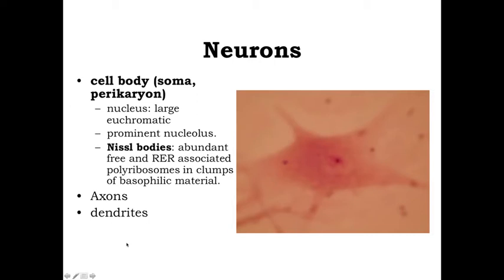We can see a relatively large nucleus, fairly euchromatic — so a pale staining presence to the nucleus — as well as a distinct nucleolus present. The nucleolus is where we're going to be producing the ribosomal RNA, and so that's going to be an indication that we're dealing with a cell that is highly metabolically active and involved with synthesizing a lot of protein.